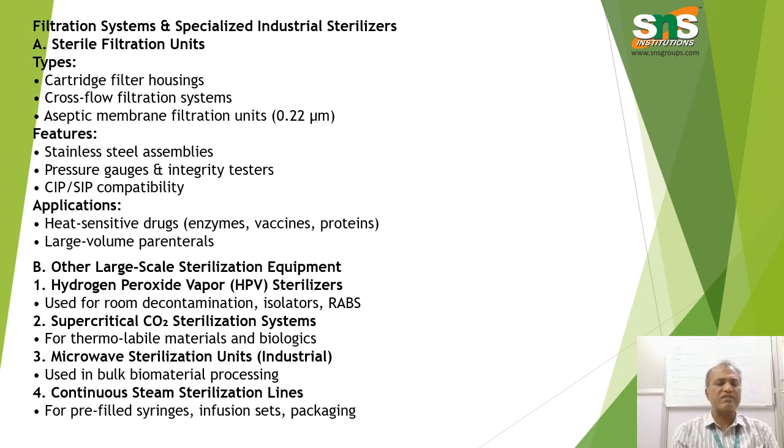Next, filtration systems. Of course, we know the use of filtration systems. It is mainly applied to heat sensitive or thermosensitive drugs like biologics, for example vaccines, enzymes and proteins. They are highly heat sensitive molecules.